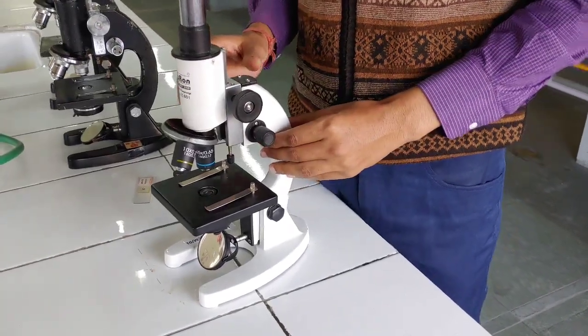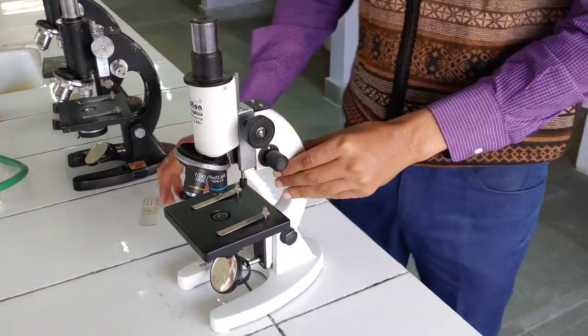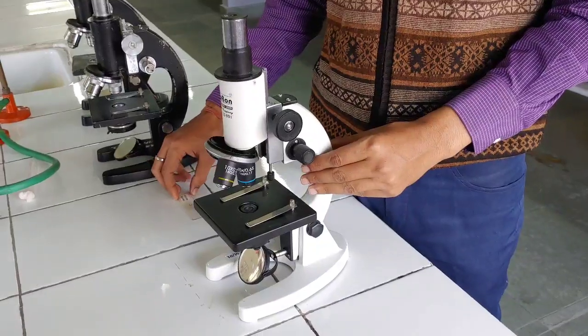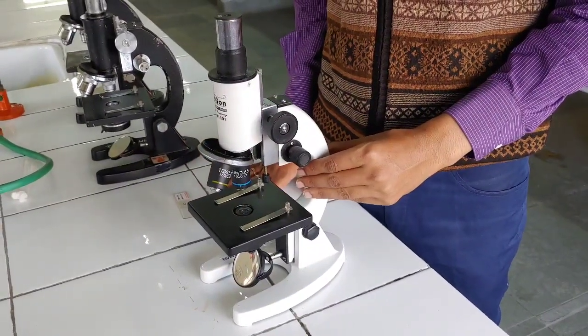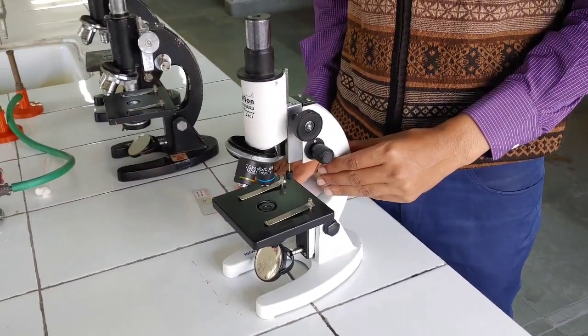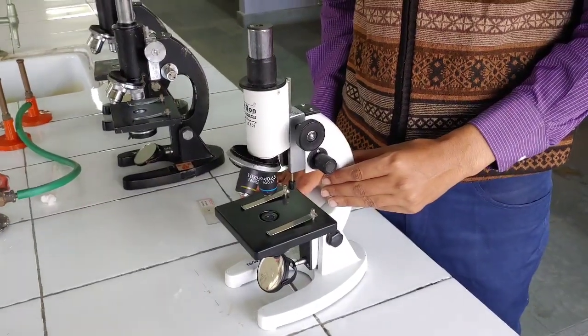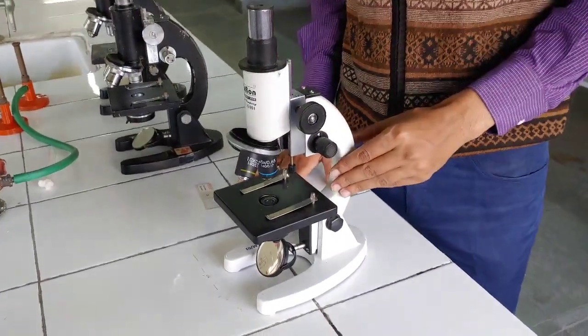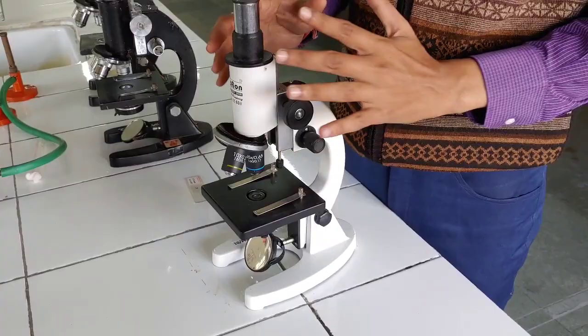Welcome students. Today we will start with a new experiment, that is study of compound microscope. What is the aim of the experiment? To study the compound microscope and its various parts.